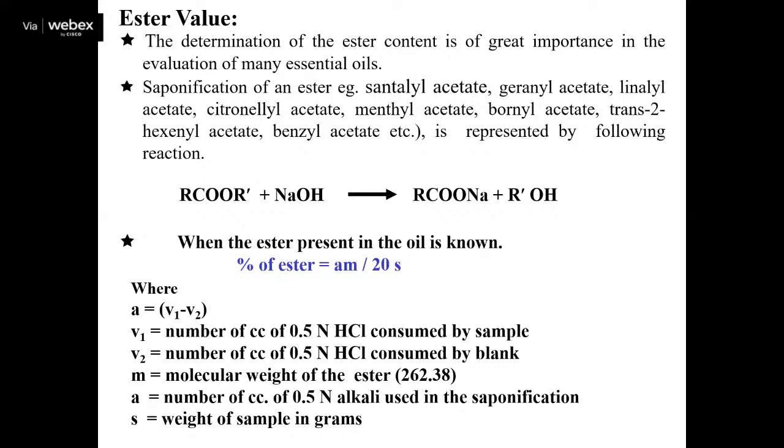Here, for the ester value of santalyl acetate, the molecular weight is 262.38. So using this formula, we can easily get the ester value, and it is a very important parameter for the Indian Standard also.